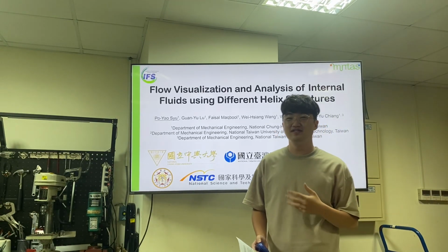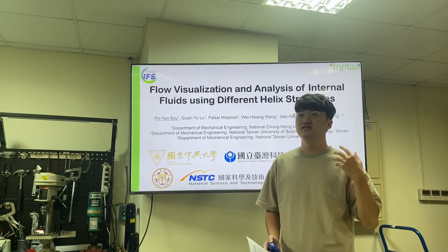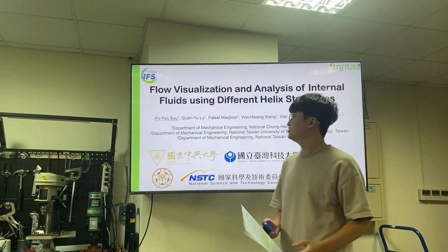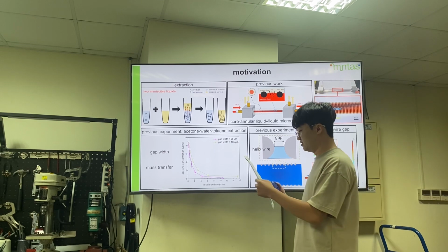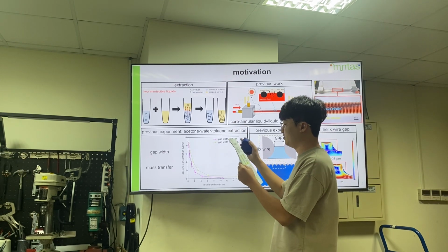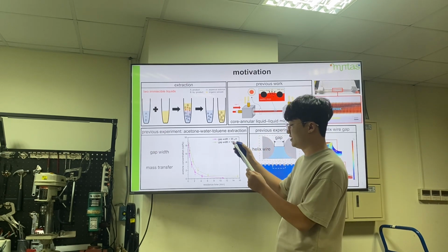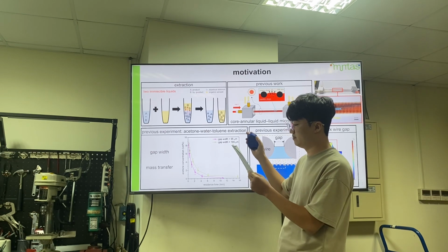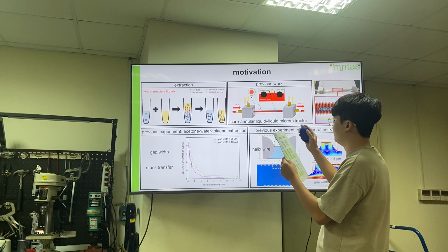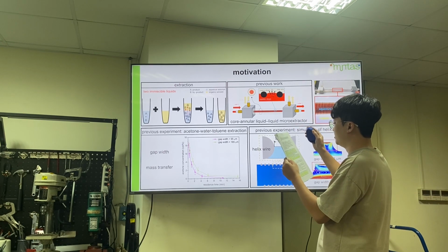My topic is flow visualization and analysis of flow using different helix structures. Extraction is a method employed to enhance purity, involving the mixing of two immiscible liquids without the need for heating or friction membrane. Our laboratory previously developed the core annular liquid micro extractor.